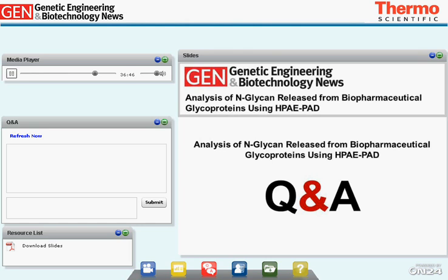Okay, and Peter, we have another question. How long does a typical disposable electrode last when used for carbohydrate analysis? We currently have two types of disposable gold electrodes. One of them is on a polyester substrate and the other on a Teflon substrate. The Teflon substrate electrodes, which have been introduced recently, last 4 weeks or longer. The polyester-based disposable gold electrodes are specified to be used for 2 weeks.